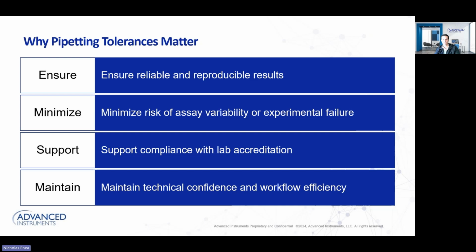The next thing is we want to minimize risk of assay variability or experimental failures. Those of you that have worked in either biopharma or a clinical lab, invariably, you've probably experienced failure in your life and you've probably troubleshot. A key that I think people forget when it comes to troubleshooting is the liquid handling portion of it, whether that be the pipette or the liquid handler.